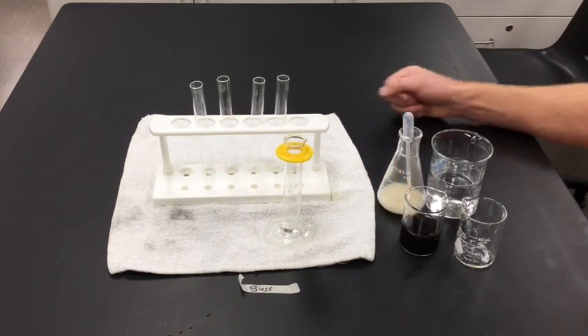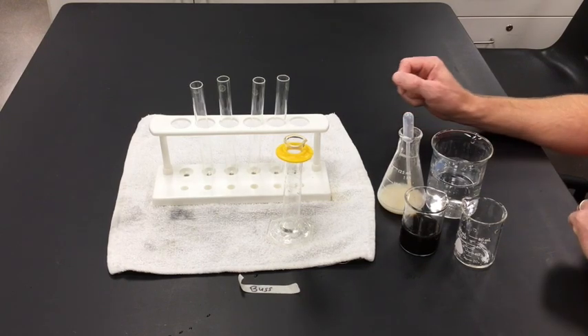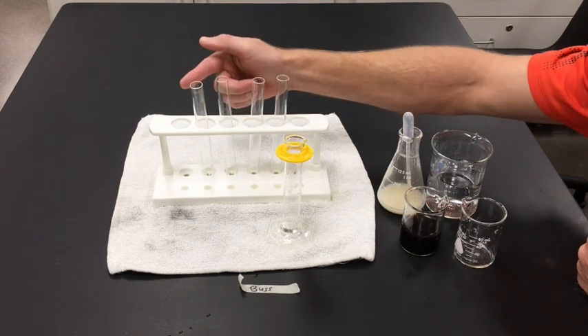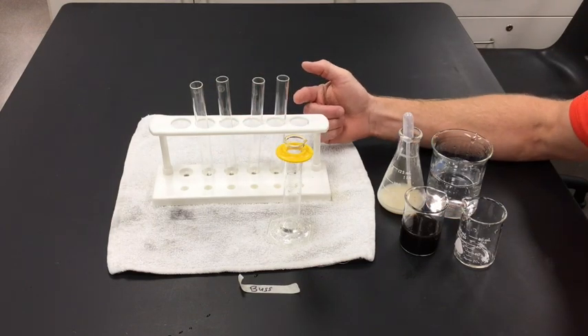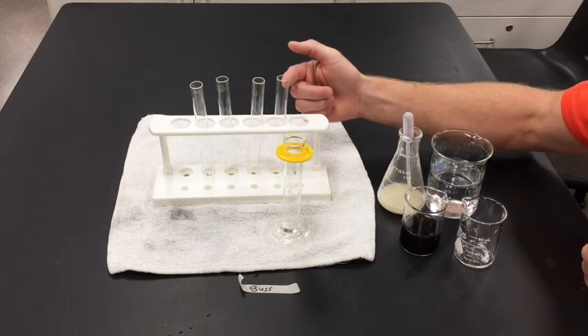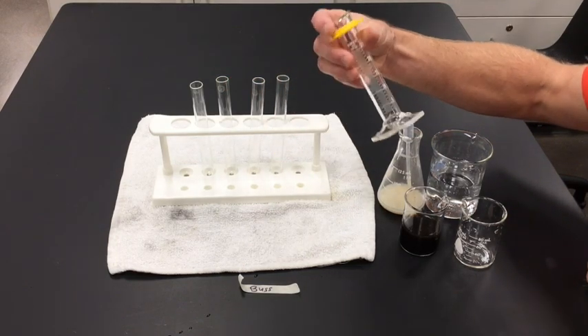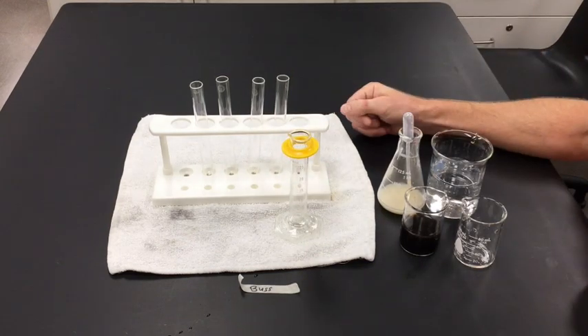Hi, this is Mr. Buss and I'm going to show you how to run the yeast experiment. Here's the equipment you're going to need: a test tube holder with four test tubes — these happen to be 16 by 150 millimeter test tubes — and a graduated cylinder. This is a 50 milliliter — oh no, it's a 25 milliliter graduated cylinder.